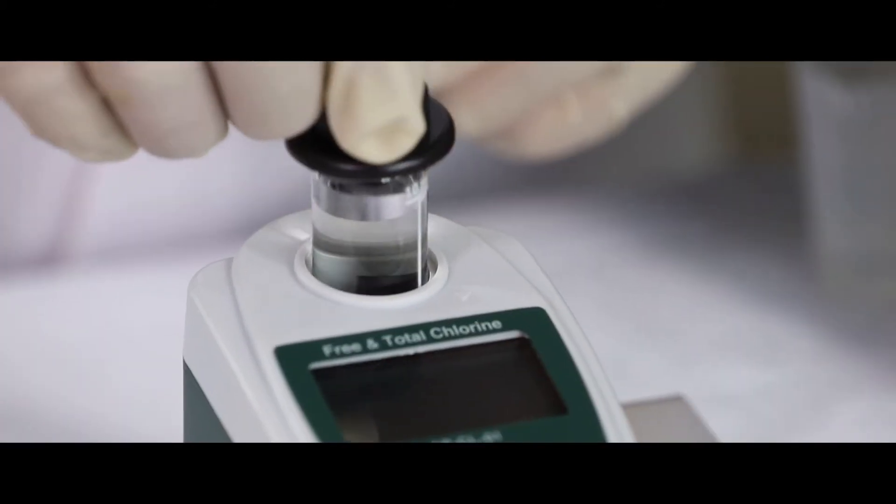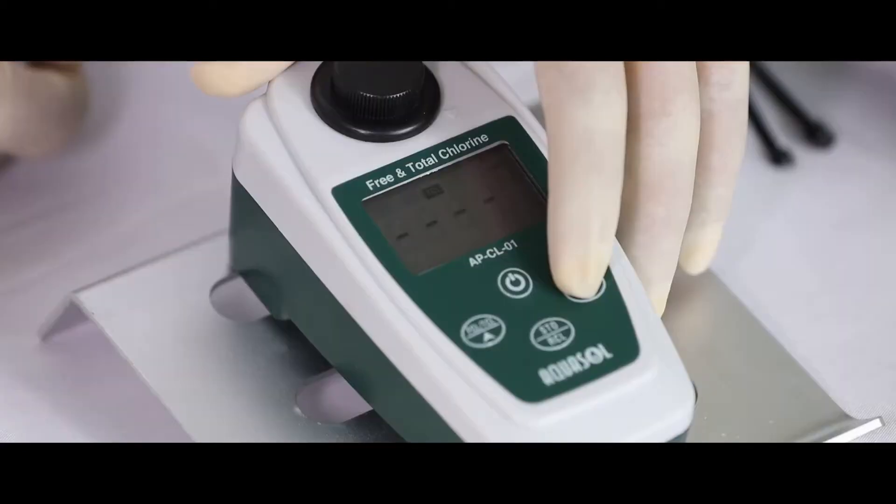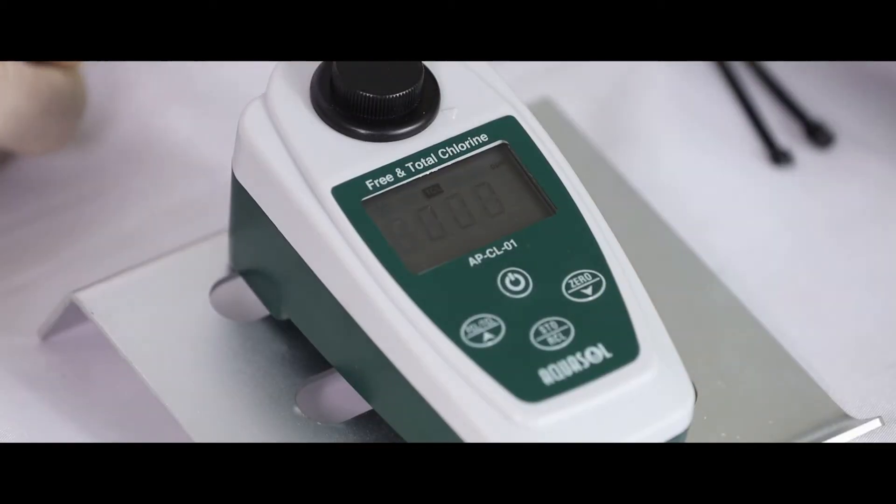Align the line on the bottle with the arrow on the meter. Press 0 key for calibration.